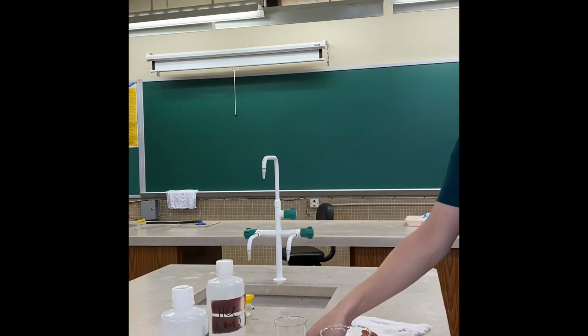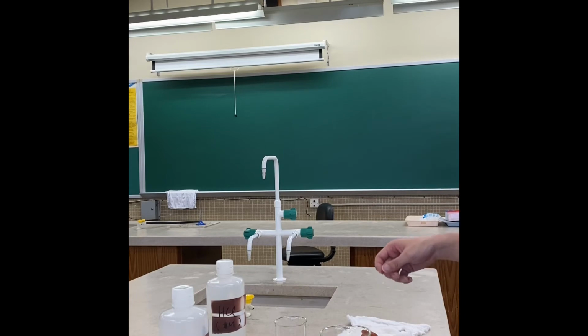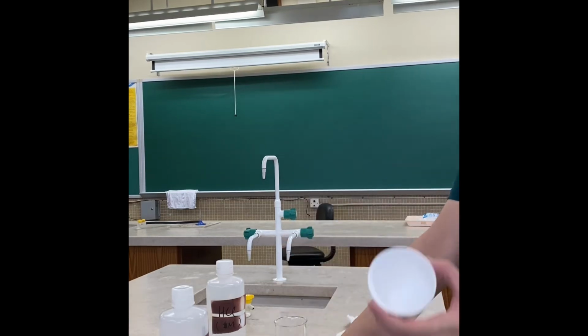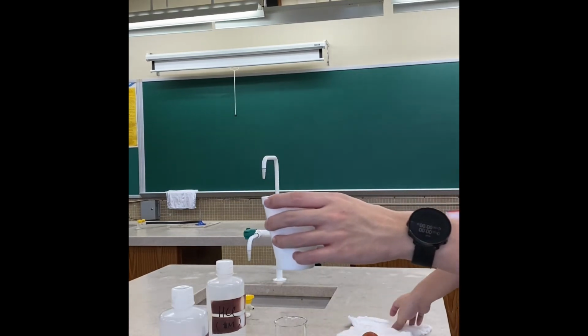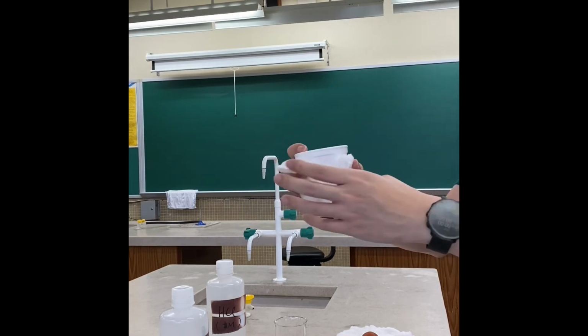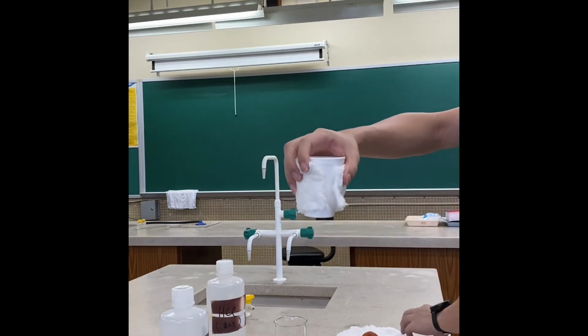After all the washing, we have to construct the set up for the calorimeter, and it's very easy. Just a beaker, and then a polystyrene cup with some cotton wool, and surround the cup by the cotton wool.